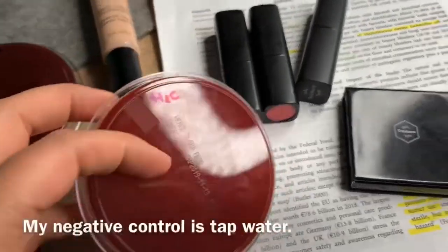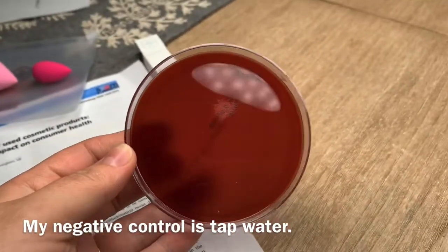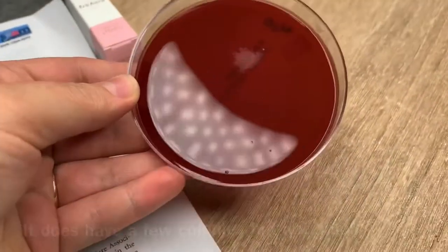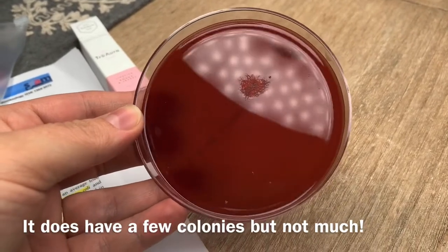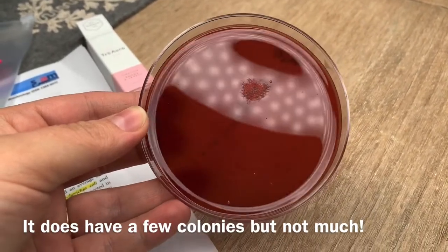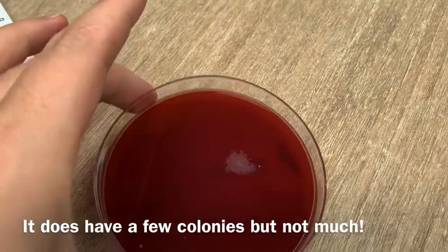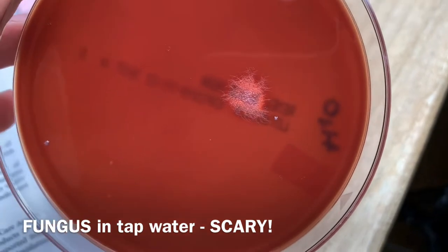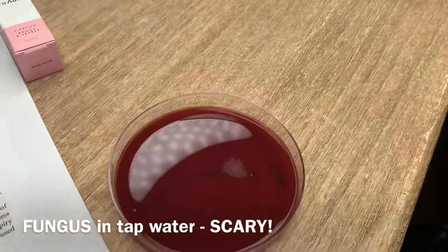As a control, I just used water. Tap water obviously is not sterile, so we can see some growth here — about one, two, three, four, five colonies. One of them is huge, as you can see in the center here. It's some sort of fungus. Doesn't look pretty at all. But this is how just regular tap water would look like.